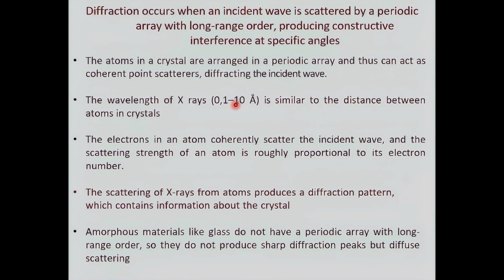A completely different situation, we will see better, is represented by the amorphous. What are the amorphous? Amorphous are materials where we maybe don't have a completely periodic distribution of atoms inside, or we can have irregularity, but not at long range, only at short range.